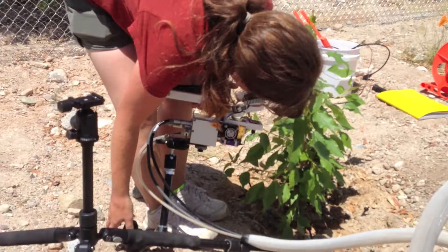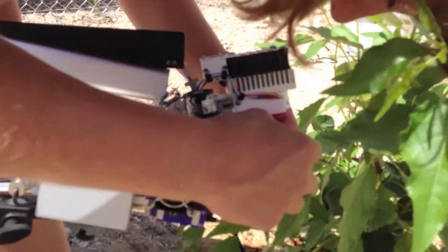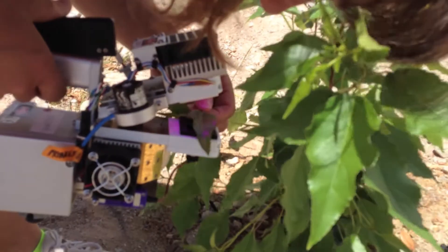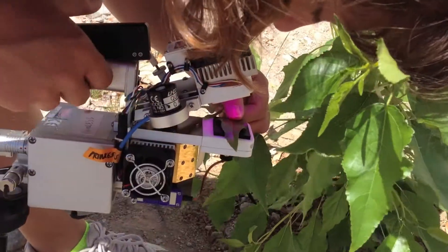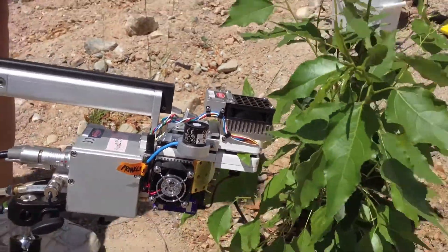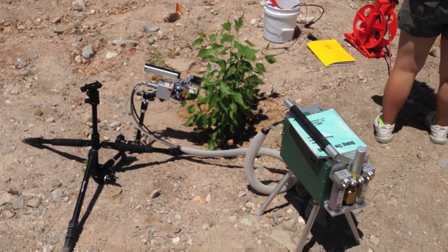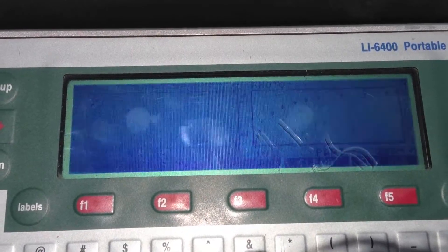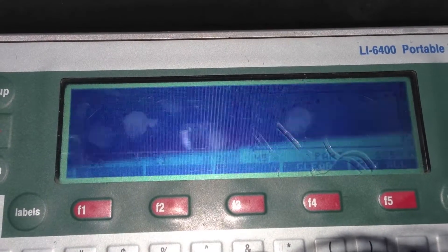This is the LI-COR 6400. It has a little chamber, and you clamp the leaf in between. It measures changes in carbon dioxide and water vapor, and uses an equation to calculate photosynthesis based on those values. Here it's plotting photosynthesis versus light intensity.